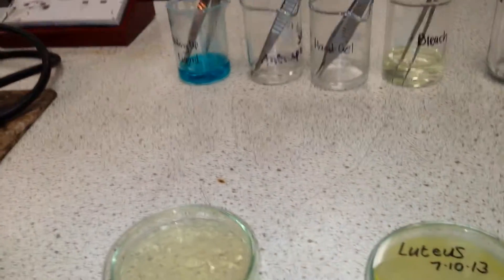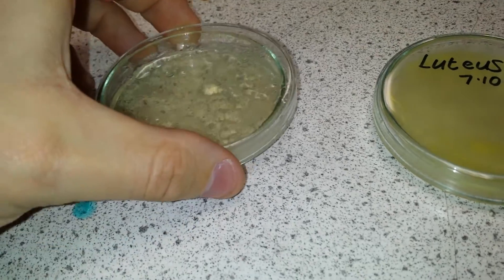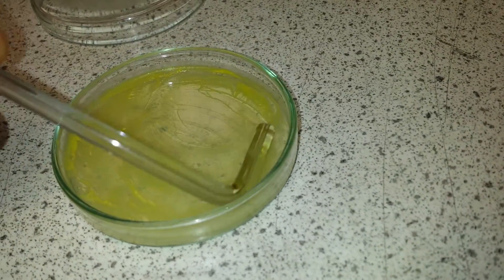You let the wand cool down in the air, then we take the lid off our dish. We go over to the Micrococcus luteus bacteria and take a swab from the jelly, working it all around.